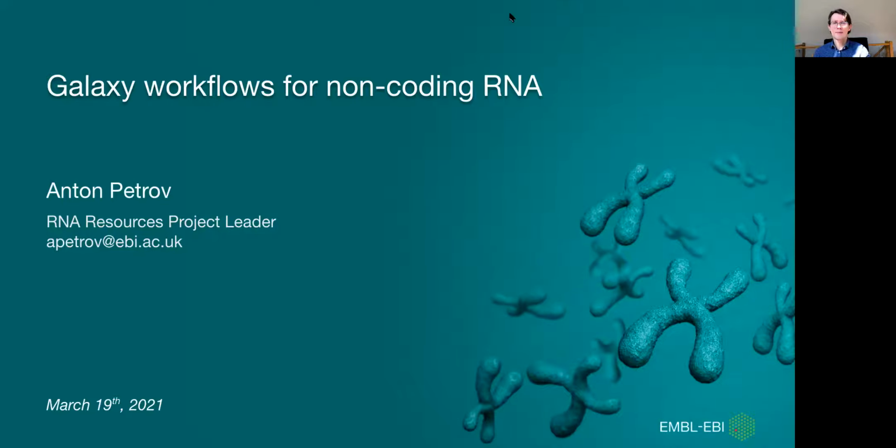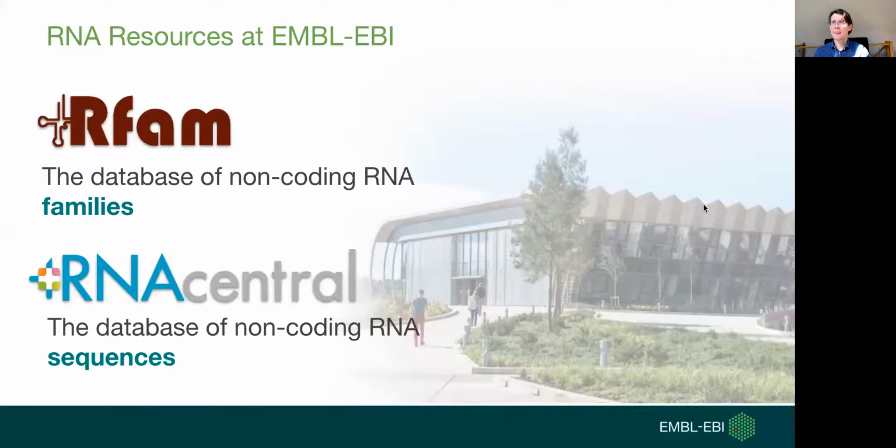Hi, I'm Anton Petrov. I'm the project leader for RNA resources at the European Bioinformatics Institute. And today I would like to introduce you to Galaxy workflows for analyzing non-coding RNAs using RNA-seq datasets.